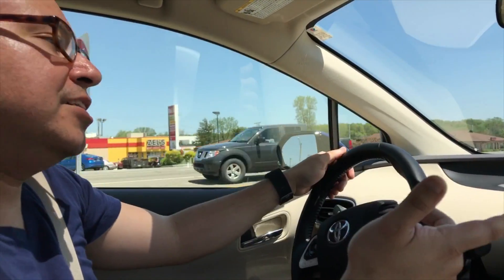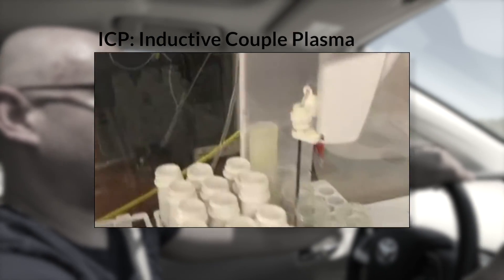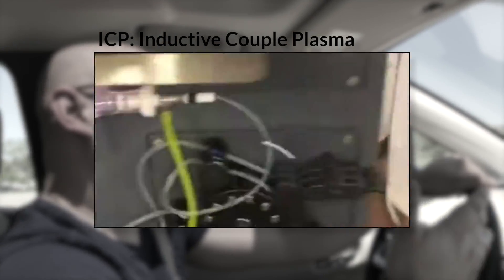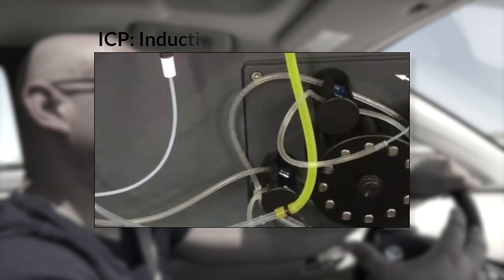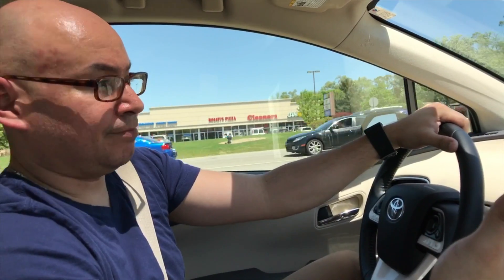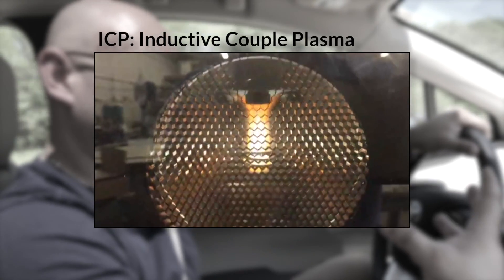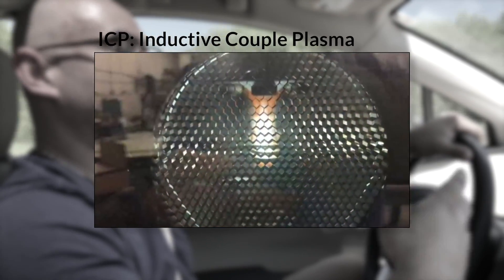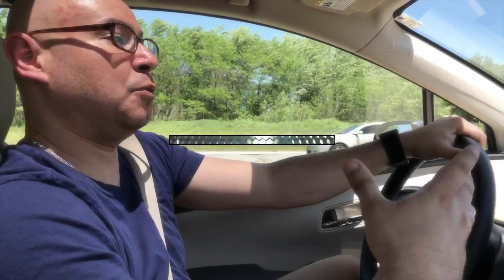The way the ICP machine works is they inject your saltwater sample into a plasma chamber, which is heated to 10,000 degrees Celsius — which is pretty hot. That heat breaks the water sample down to the most basic elements. As the water sample is heated it breaks down into elements, and each element releases a wavelength. The machine then measures the concentration of each element by measuring the energy released by each of those specific wavelengths.